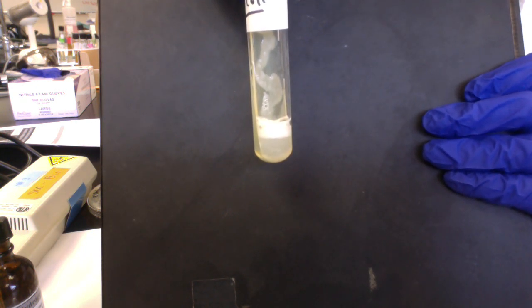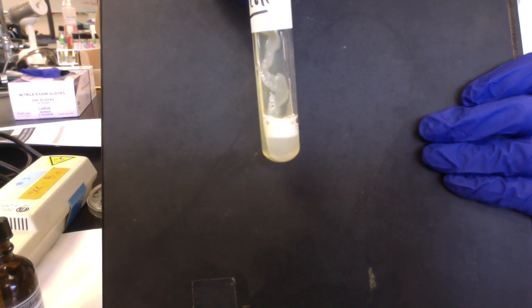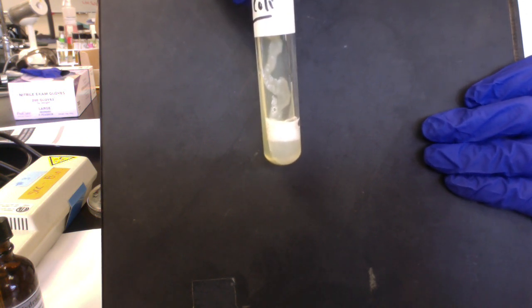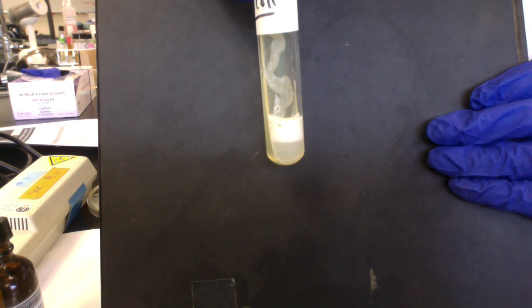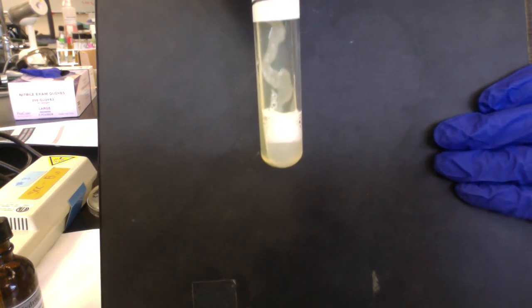And again, one of the applications is we can use a catalase test to distinguish between Staphylococcus, say Staphylococcus aureus, which would be catalase positive, and members of the genus Streptococcus. So all members of the genus Streptococcus are catalase negative. So for example, Streptococcus pyogenes would be catalase negative. Okay, folks, I hope you can see that a little bit better.